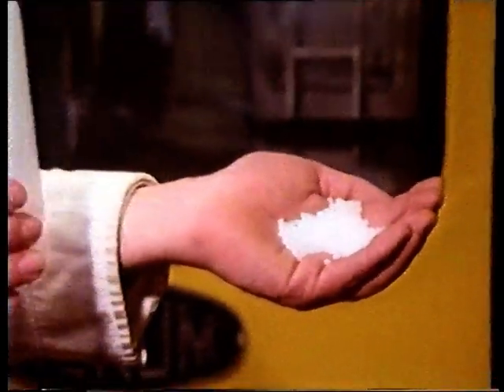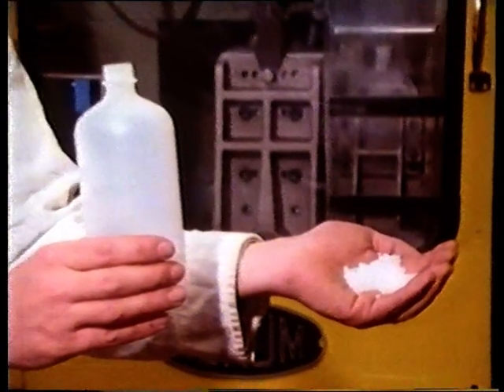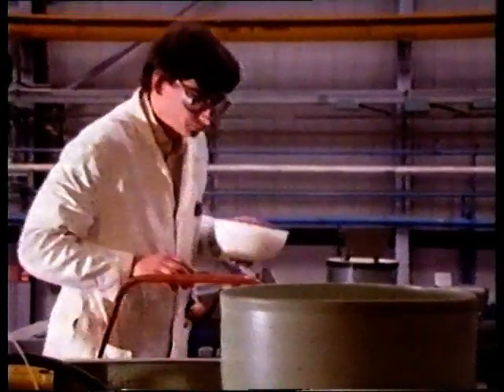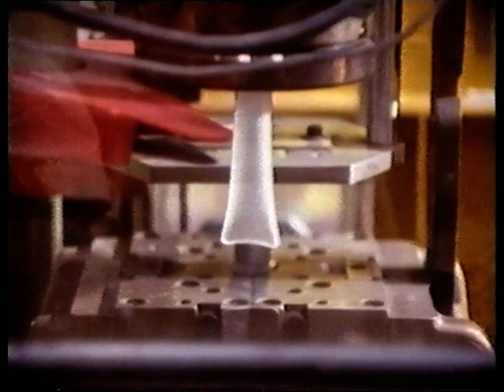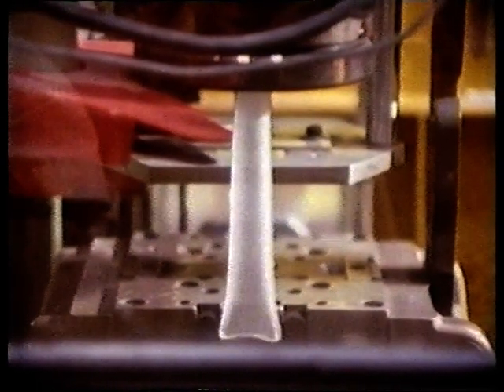The polyethylene pellets can be treated in another way, for making bottles, for example. This machine in the development laboratory back at Grangemouth melts the plastic, then blows it into bottle-shaped moulds.